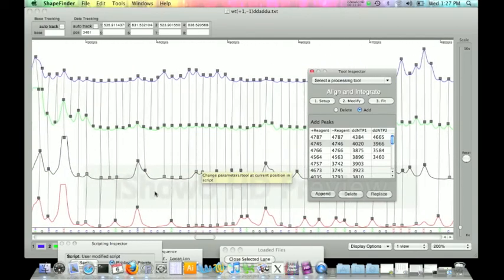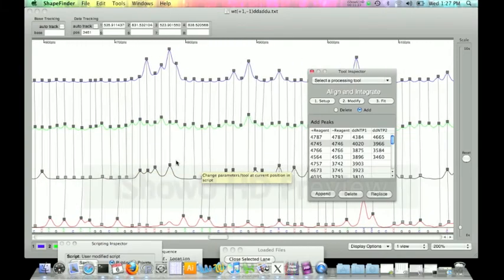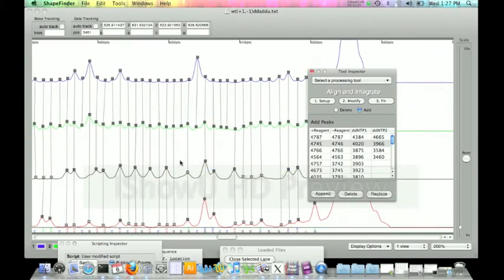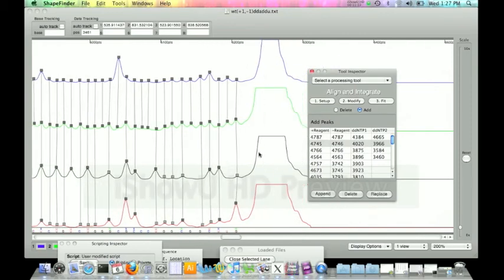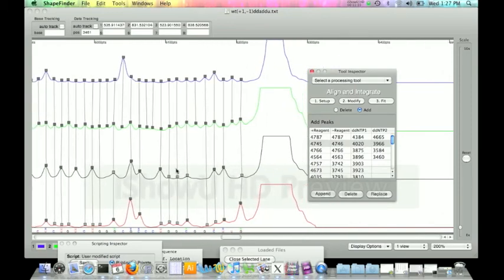We're going to keep going all the way to the front because we didn't necessarily take care of the front part. All right, now we're at our front, and this is where the sequence begins, right near the primer front. So we can see that it's not too well lined up with the ladders. We still have a couple spots missing. I know for a fact that this sequence, if you'd like to check, starts with a CG positioning, and right now we're at a GUU.